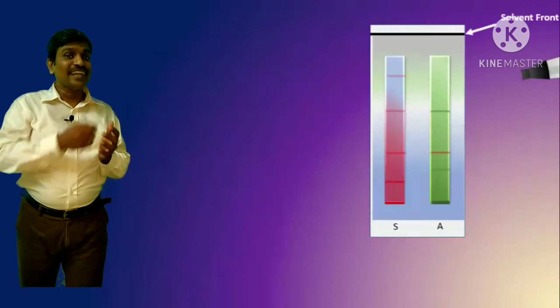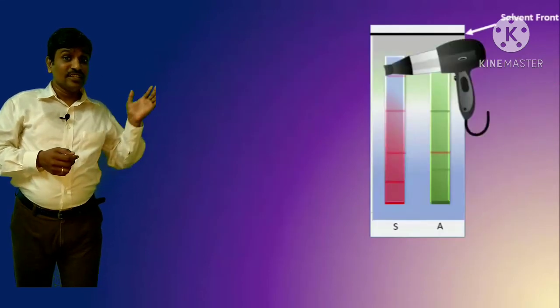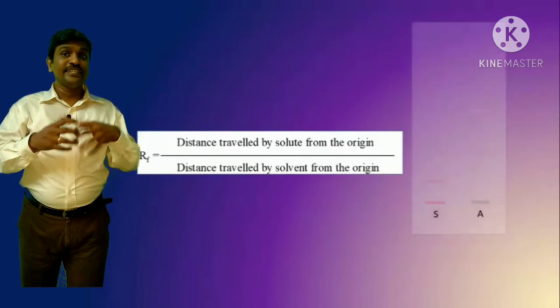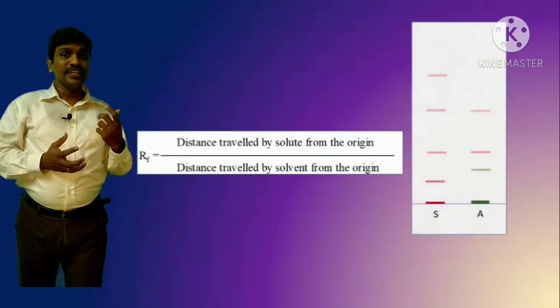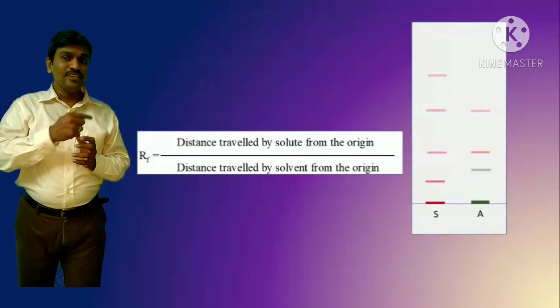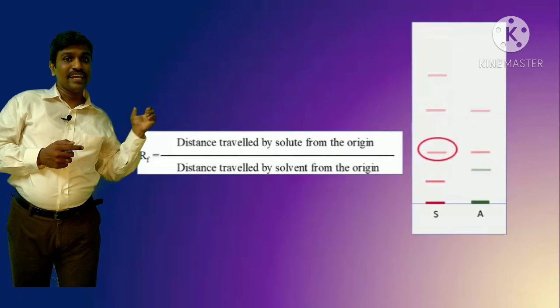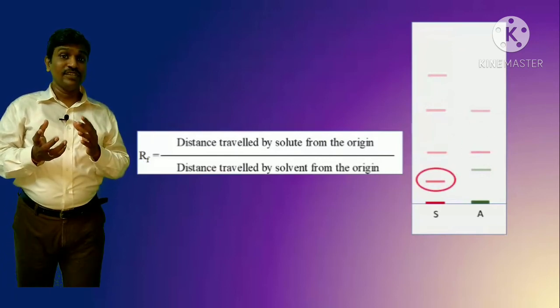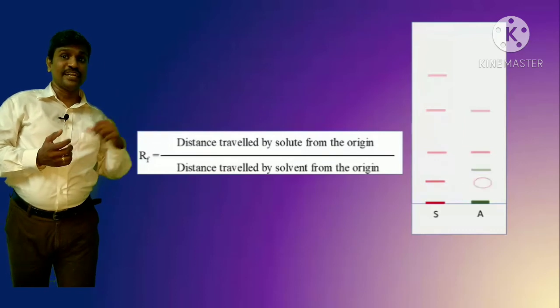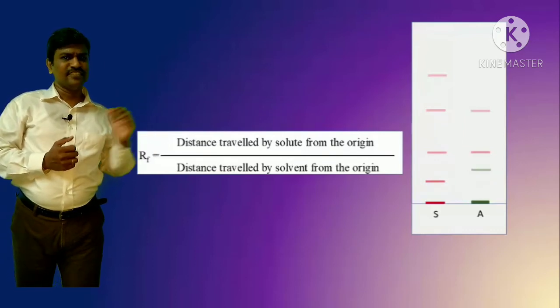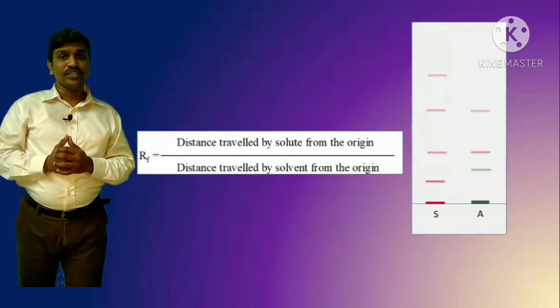After drying, keep the plate in a developing reagent. The developing reagent will react with your spot or phyto constituent and color it. Then dry the plate again — you can see the plate being dried here. Once dried, the color develops. You can now see the standard (S) and the sample (A). If the markings match, the drug contains that constituent found in the standard; if not, the mark will be absent.